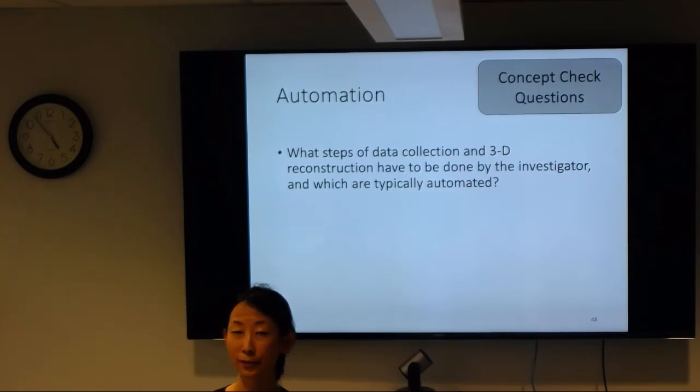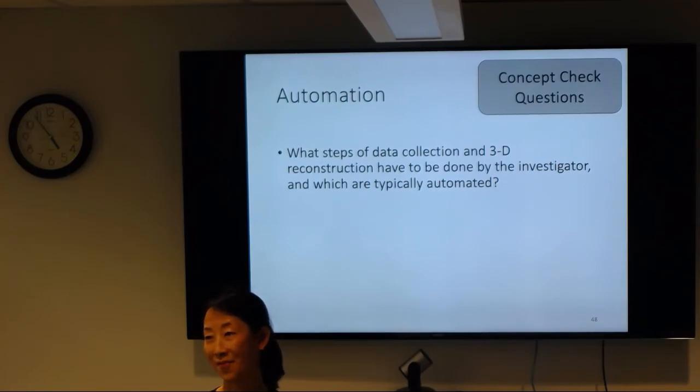Sample preparation, is it automatic? You have to apply your sample to the EM grid if you want to use Vitrobot. If you want to use Spotiton, you put your sample in a little tube and then basically press a button or a series of buttons.